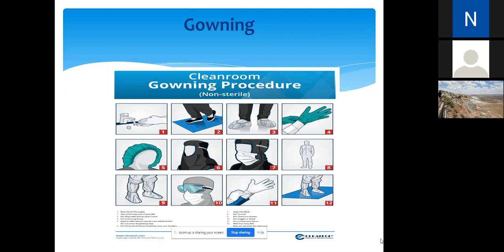In order to minimize the amount of junk you bring to the clean room that can be detrimental to the processes, there are some things you can do and cannot do in the clean room. There are some things you can bring or cannot bring to the clean room.